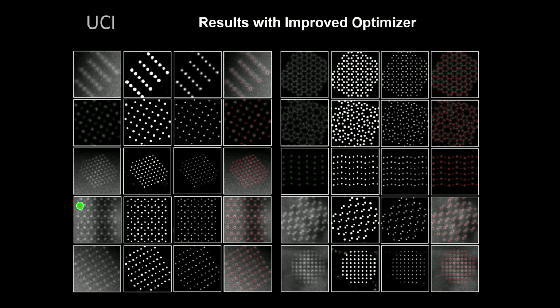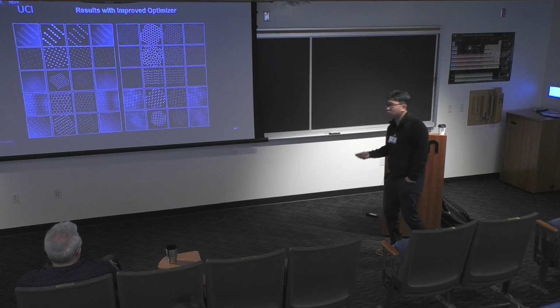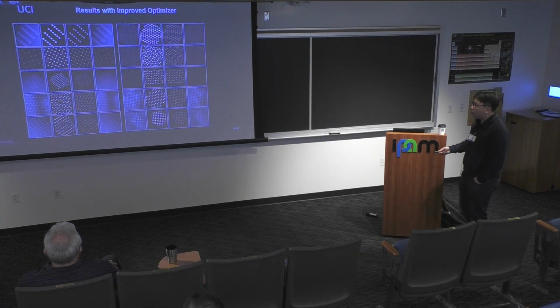This is on the validation set, and this is the segmentation mask, the super resolution processing, and this is the localization. These initial models, we have deployed to an app and put on GitHub. Anyone can use it and try. And I think Paul, your student has tried it, right? And these are validation images. It works well on them, right?